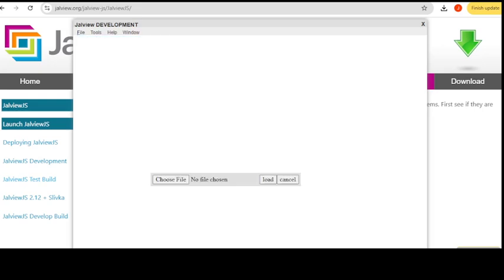Okay, here you go. So now you have this created. You need to now choose that file that we created earlier from the multiple sequence alignment in the previous video. So all you have to do is say choose a file right there, and here you go. That's the one, MAFFT, right?